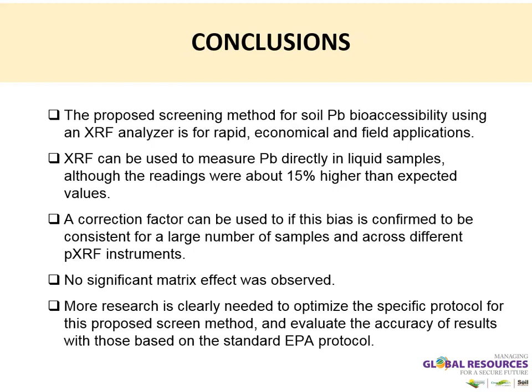Correction factor can be used if this bias is confirmed to be consistent for a larger number of samples and across different XRF instruments. We did not see any significant matrix effect, but there was precipitation or sorption when we added spikes into the soil directly. So we still need to do more research to confirm our findings and optimize the specific screening methods, so it will be more comparable with the EPA standard protocol that is currently being used.